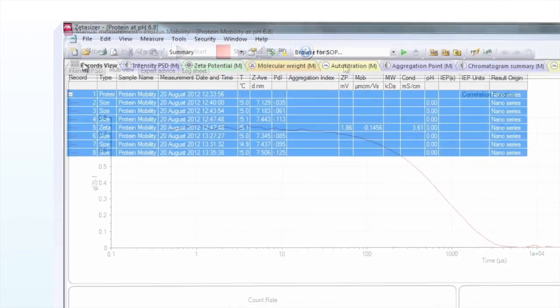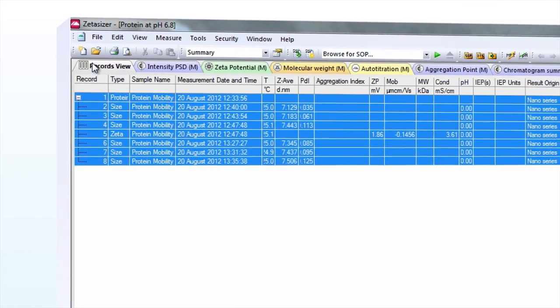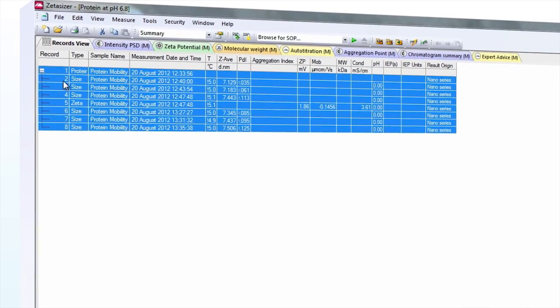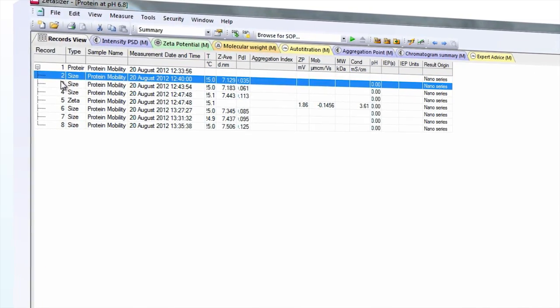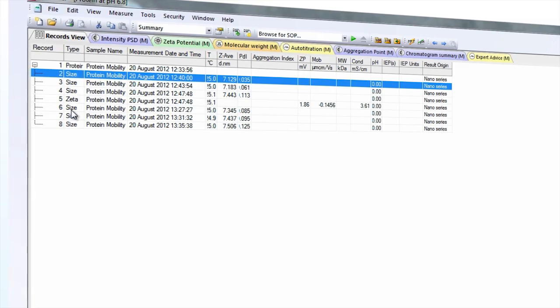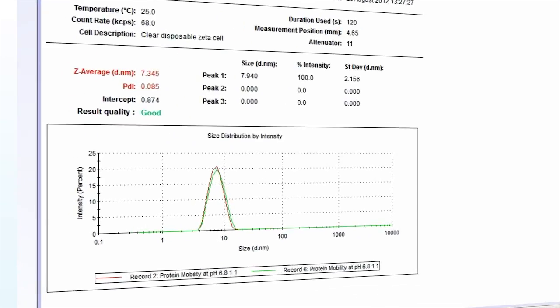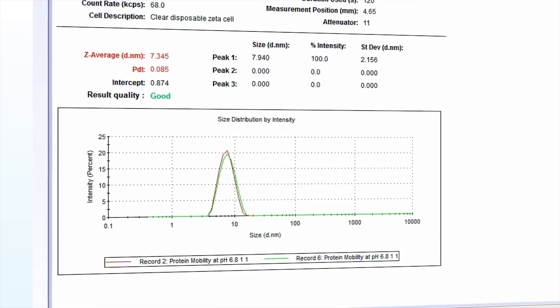At the end of the measurement, the results are displayed in the records view of the Zetacizer software. The size measurements before and after the Mobility measurement should indicate that the sample hasn't changed during the measurement. Here the size distributions overlay well, indicating the sample has not aggregated.